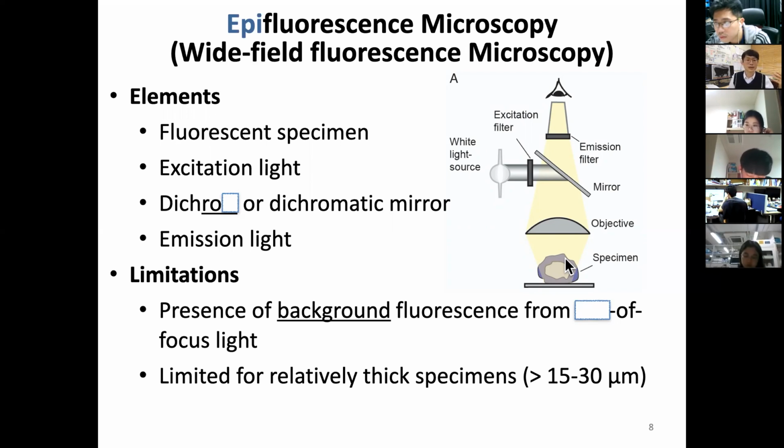So let's say, Zui. Yes, Professor. Can you guess what this is? This is our out of focus light. Great. Yes, out of focus light. Okay. So that makes our microscope a little blurry.